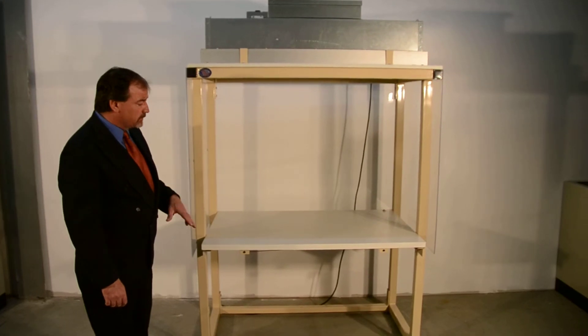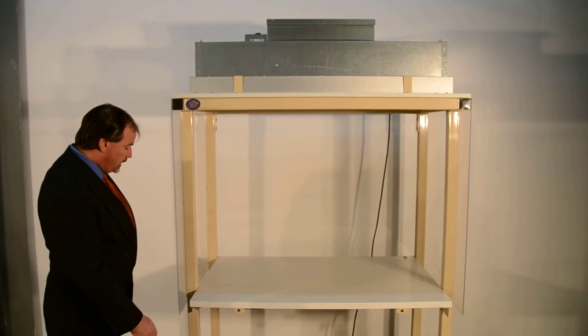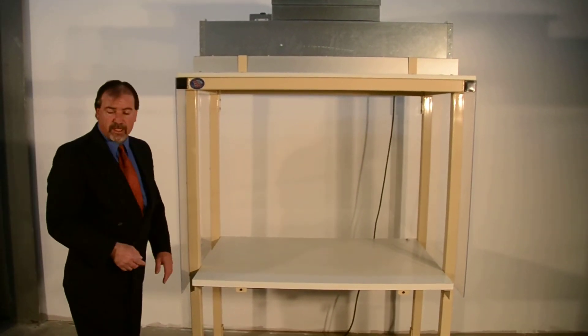In addition to the air flowing out the front of it, we also have our two-inch frame here, and the plexiglass is mounted to the outside of it so the air can flow down either side of the work surface.